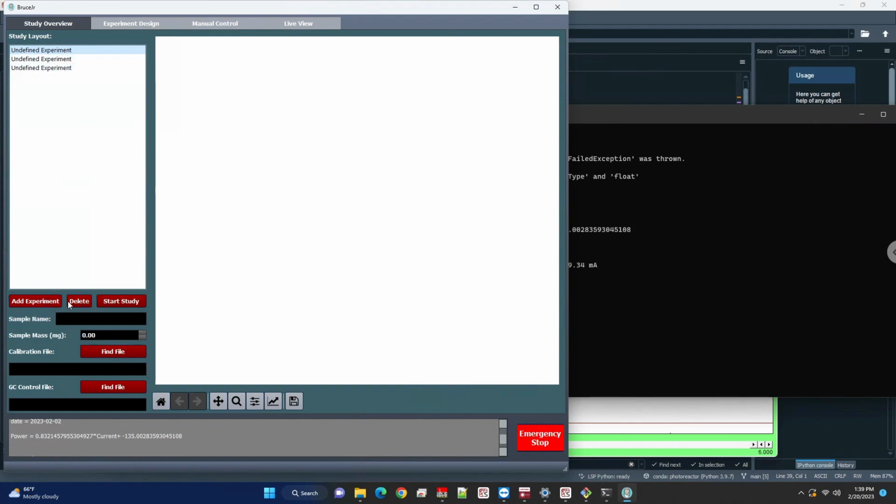So you can create those with these tools below. You can also delete them. And you can set some basic information for the sample that you have. So usually I like to label my sample with some kind of date. So here is just today's date. And then you might also want to add in what kind of material you're working with. So 100% silver sample, and any other kind of identifiers you want to put here.